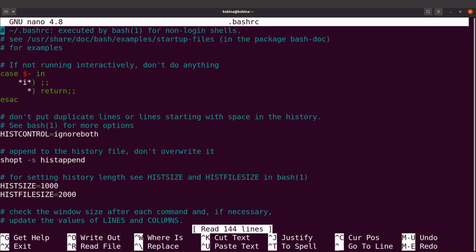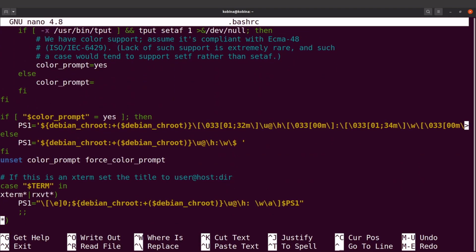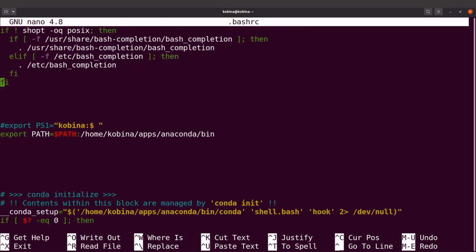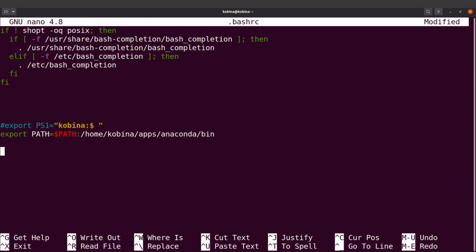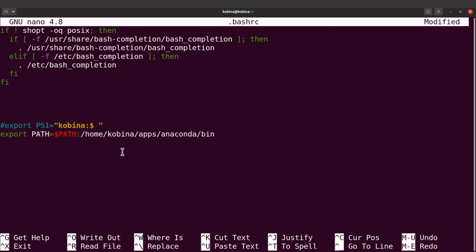Then I'll open it. I'll move to an empty line, and then I'll enter my command here. I already have Anaconda installed, but I'll add another thing here. So I'm going to issue a similar command here. But this time, instead of specifying this one here, I'll put in the path for megahit.